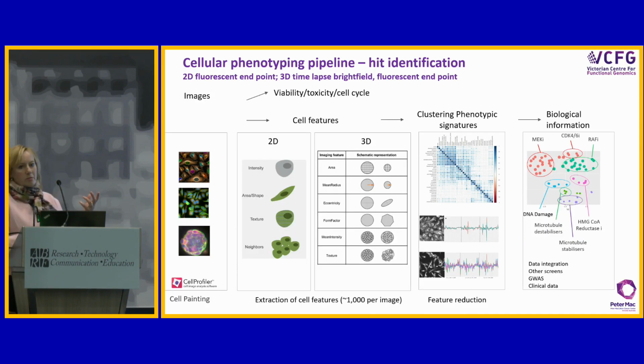And so our pipeline, as the way we describe it, very much as Erin's, is taking your images here and then feeding it through the CellProfiler pipeline. We will always report on viability, toxicity, and cell cycle as read. That will be done for every single screen. But our feature extractions, we are using that in a 2D setting and also in a 3D setting. We actually co-opted parts of the CellProfiler pipeline to develop our own 3D pipeline.